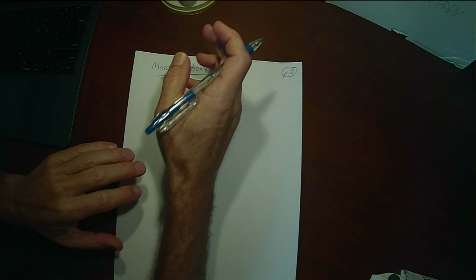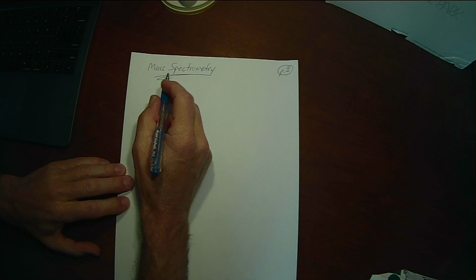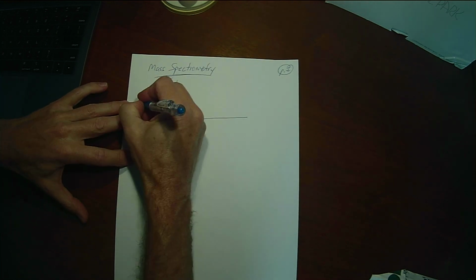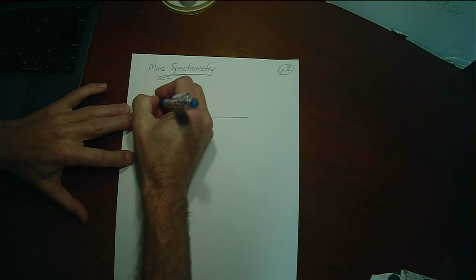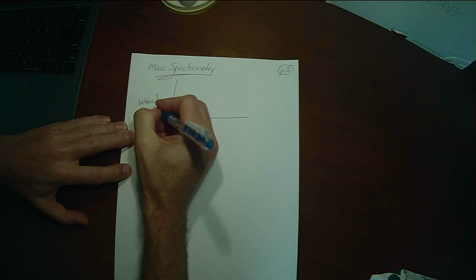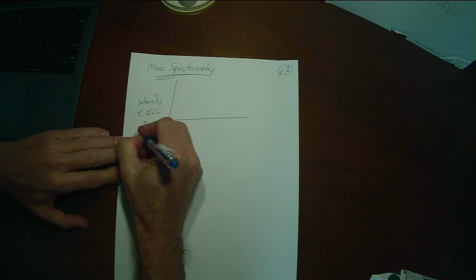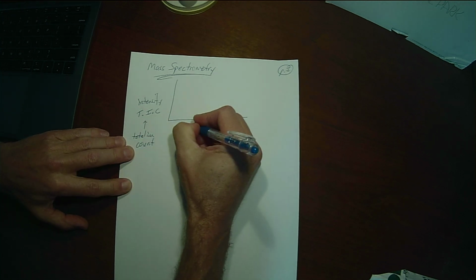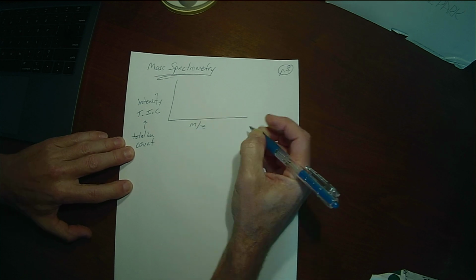So the first thing I want to point out about mass spectrometry is it's spectrometry, not spectroscopy, because it actually has nothing to do with electromagnetic radiation. The spectrum that you're getting in mass spectrometry is intensity on one scale, and that intensity is usually in what we call TIC, which is total ion count. And then on this scale is the mass over charge ratio.